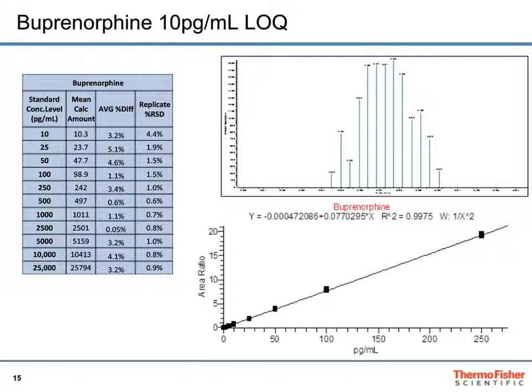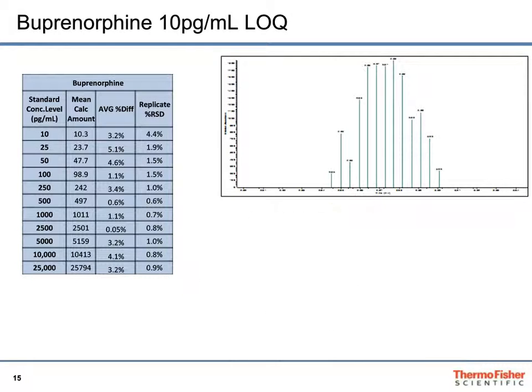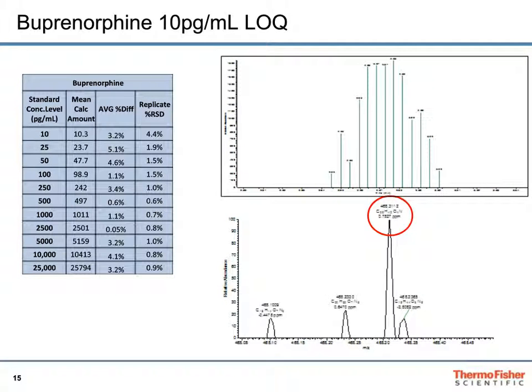When we look at the spectra for this compound, we see that in this case, this is the most intense ion in the scan. Now, as I mentioned, we set this up using generic mass spec conditions. We did not optimize the source, gas, heat settings for the mass spec. But I believe that if we did, we could actually get better than the results we're displaying here. But for this particular experiment, we wanted a generic approach just to see how well we could do for this particular mix of compounds.